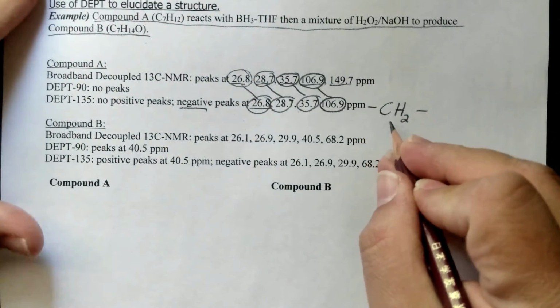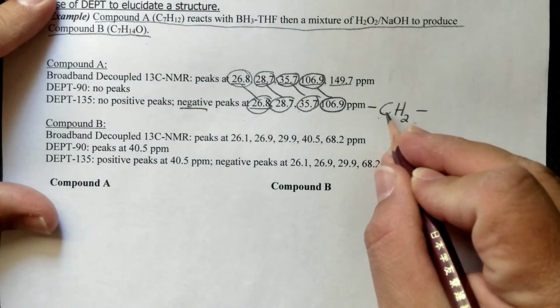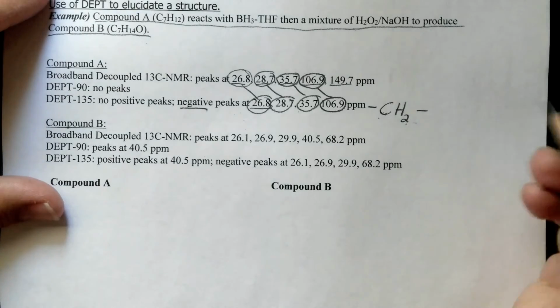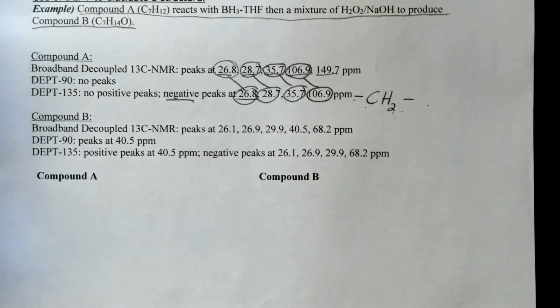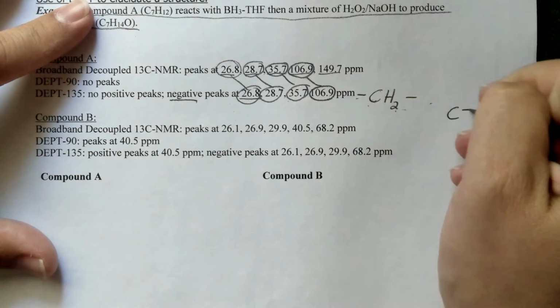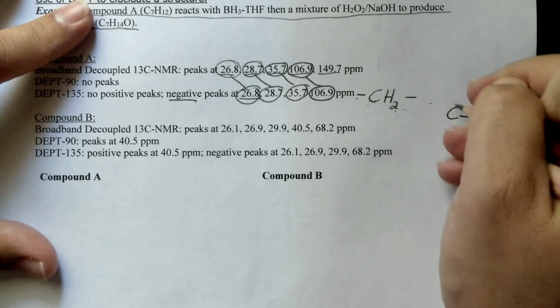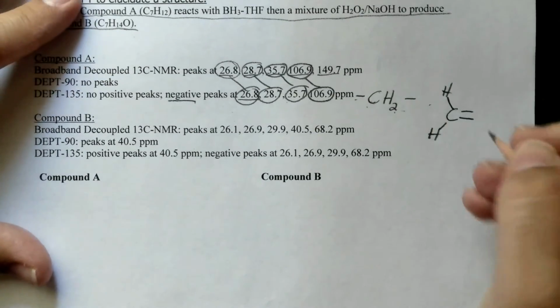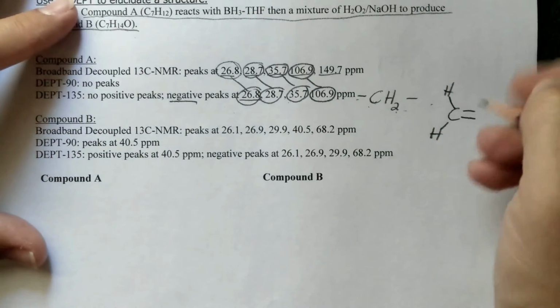Now mind you, keep in mind, this CH2 doesn't have to be a single bonded carbon. It can be a carbon with two H's and then something bonded on each side of the carbon singly. So another carbon atom maybe on each, or a chlorine, or oxygen, it doesn't really matter what, it's just not a hydrogen. But it can also be a carbon double bonded to something, not hydrogen, and then two H's. More often than not, it's a carbon, because if it's an oxygen, then that's the end of the molecule and it'd be formaldehyde. But so probably a carbon.